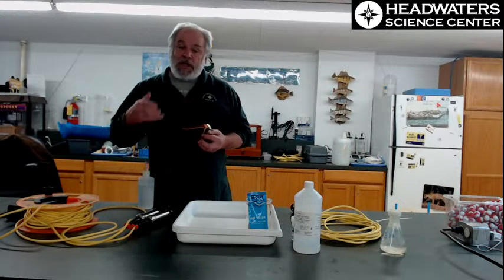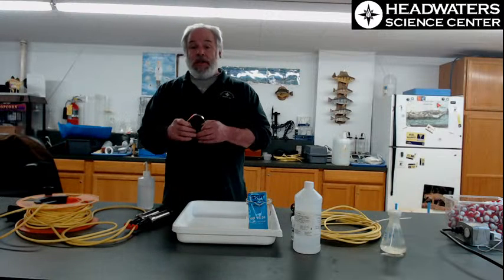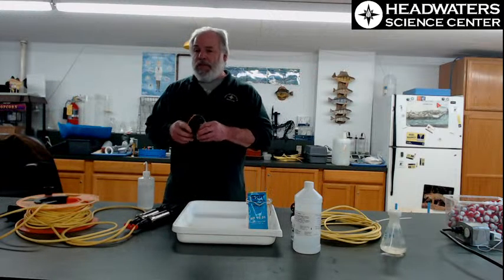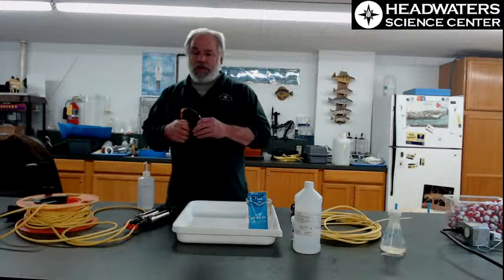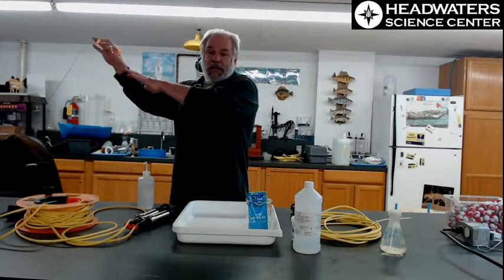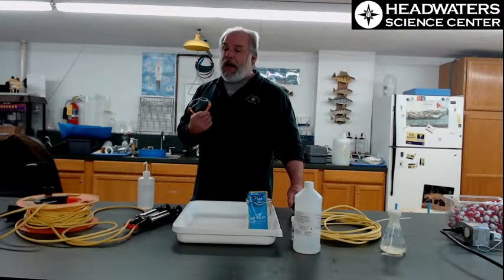Now, conductivity is a good indicator of things that are dissolved in the water, and this time of year there are many things dissolved in the water. The chloride, potassium chloride is one of them. There's a mixture of chloride that they use on the road salts. There's the pollution. There's the nutrients that have been sitting up in ice that are moving into the aquatic systems now. So we're looking at things that are dissolved in a conductivity.